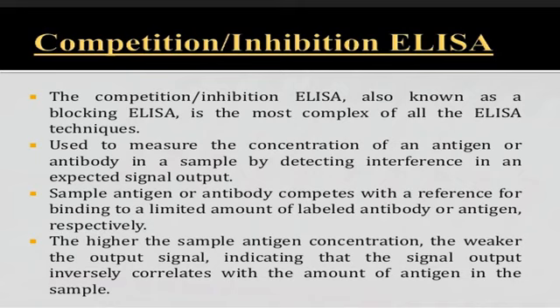هذا النوع الأخير من الإلايزا تكنيك اللي هو الكومبيتيشن أو انهبيشن تكنيك، هو بس مطلوب منكم بس الاطلاع. هو very complex technique.